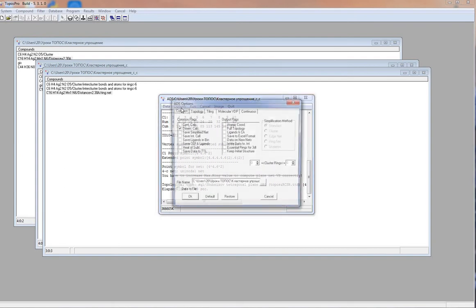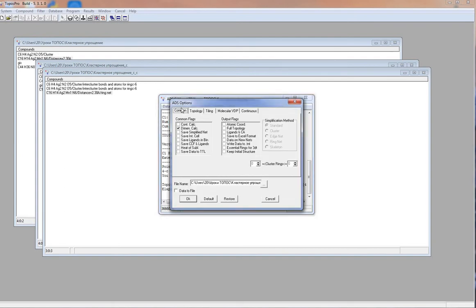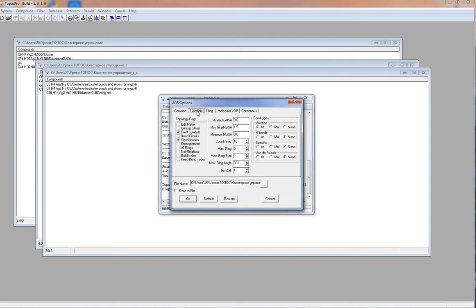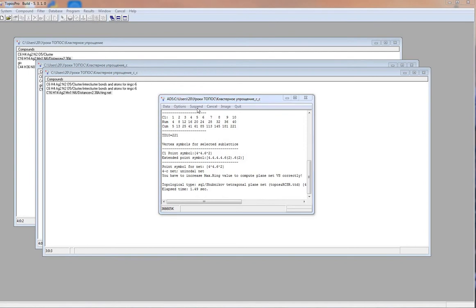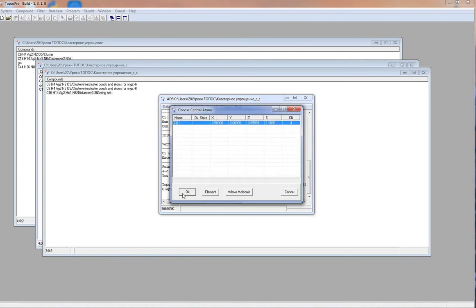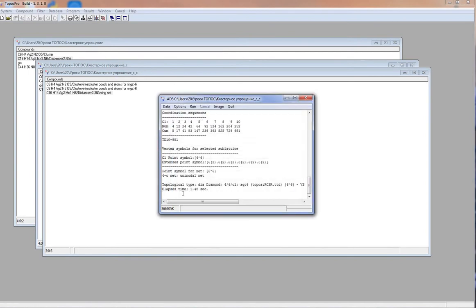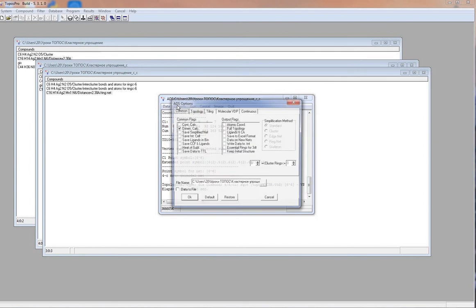The same procedure can be made for hydrogen bonds. ADS, options, topology, valence bonds none, hydrogen bonds atoms. This net has DIA topology. This is the topology of catenation. At last, we can consider both bonds type.